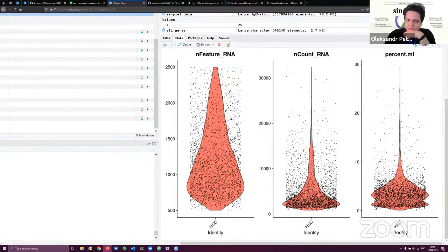But as Alexander already pre-qualified the data set, you said that you already cleaned it up. It means that we don't need to clean it up too much further.